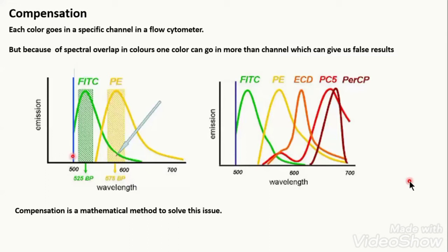So you can see I have added 2 antibodies, FITC-labeled antibody and PE-labeled antibody. So we face a problem of what? Spectral overlap. Imagine I am adding 1, 2, 3, 4, 5 antibodies. So much overlap of spectrum, spectral lengths. So it is again difficult to analyze the data. So the more complex an experiment you design in flow cytometry, the more difficult it is to explain or analyze the data.